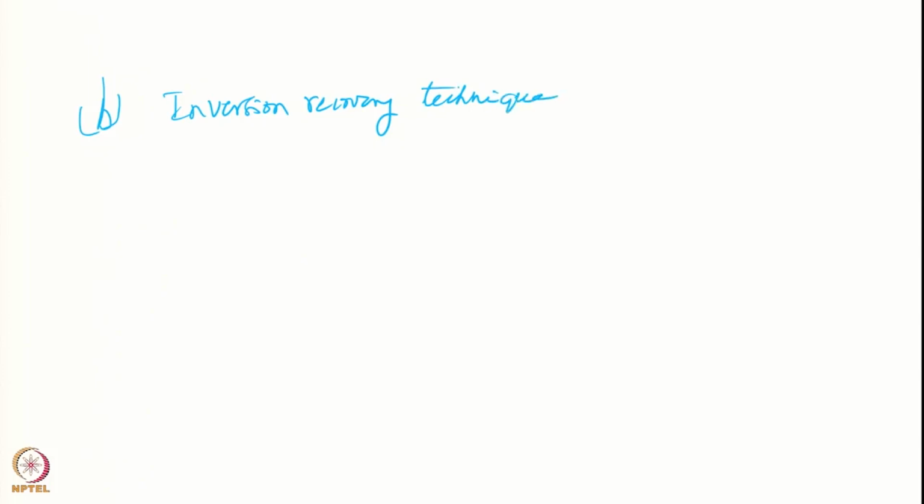So, what we do here is, it actually uses more than one pulse. The strategy will be like this: you apply a 180-degree pulse, a hard pulse, wait for a time tau, and then you apply a 90-degree pulse or whatever flip angle you want to give, and you collect the FID here.